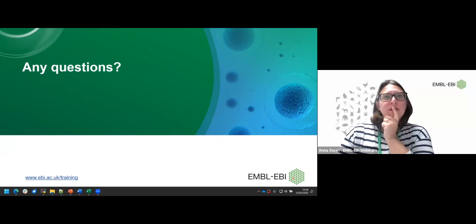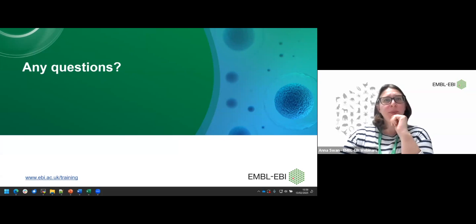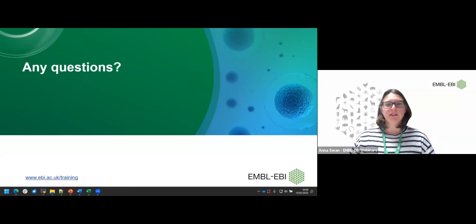Right, so the first question that we have is, would you be able to elaborate a bit more on the BLAST algorithm itself? So, for example, just a bit on how BLAST works. I understand that you can't take us through a demo step by step at the moment because, as you mentioned at the start, but if you can provide any more information on that.